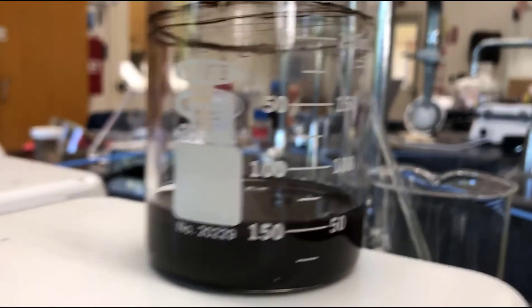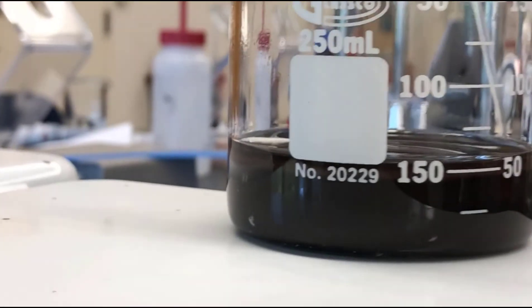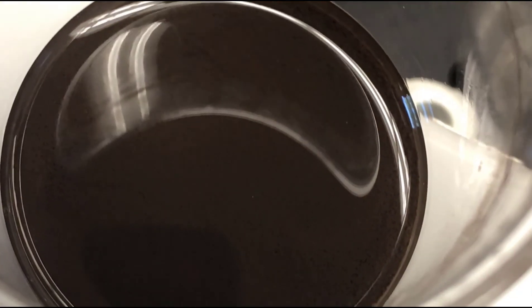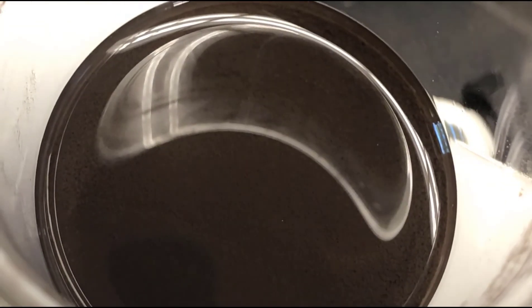That's my black copper oxide. We'll look at it from the top too. You can see it's pretty finely divided — small particles. Those are the crystals; you can see them. There'll be a bit more of those crystals.